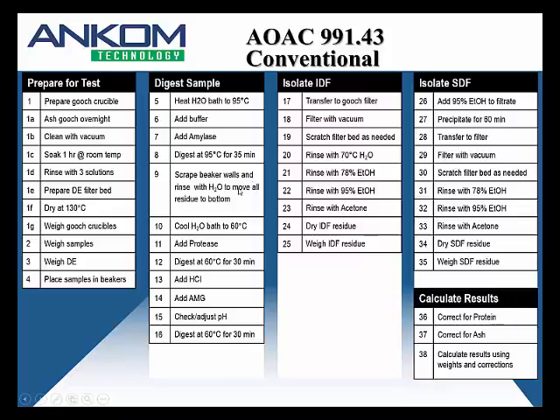It does not include the times that you have to scratch the filter bed, really the gel surface, in order to continue filtration when you're going through a filtration process. That can be a lot of return times, as you might have seen a little bit on that video that I just showed you. Those are things that have to take place in the conventional method.